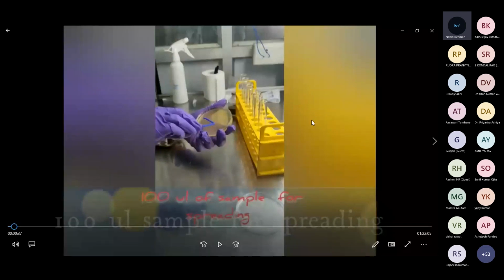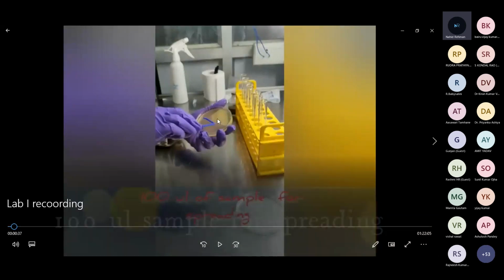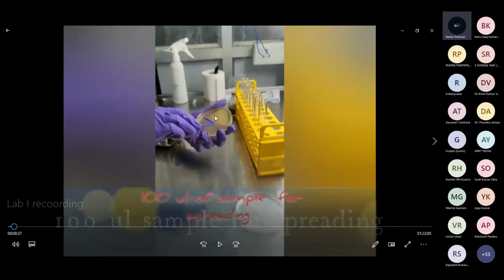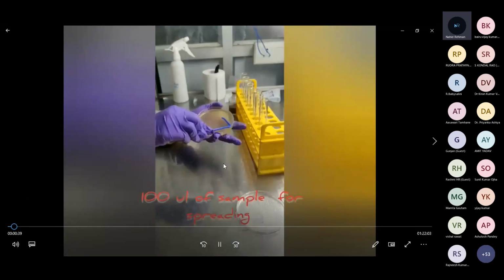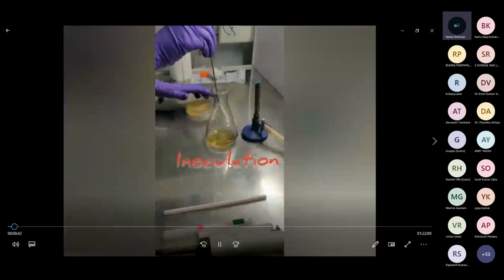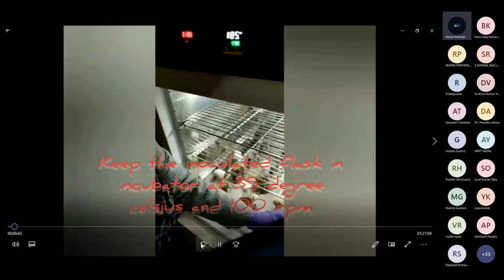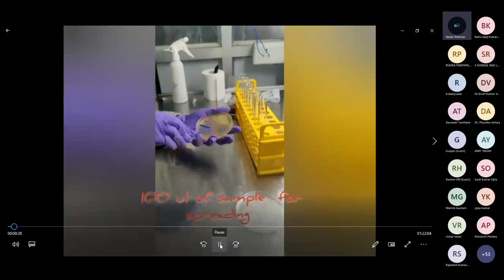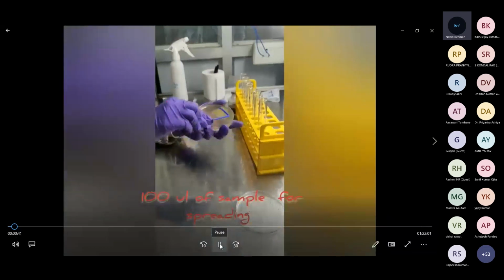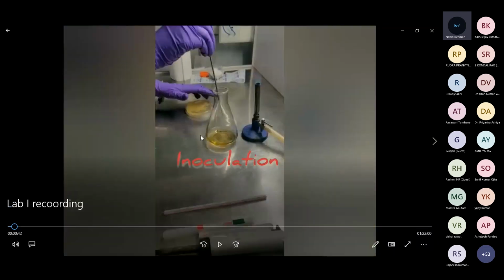So there, after 18 hours, you will see that there are distinct colonies. Those distinct colonies can be picked up, and those distinct colonies are the group of microbes you obtain. As you can see here, I'll come to that. Here you see this plate. Here she has overgrown it. It is a pure culture actually.